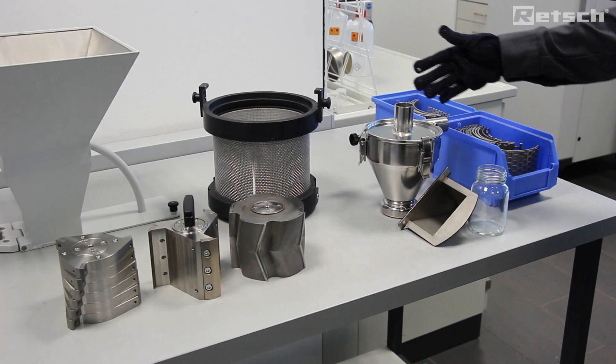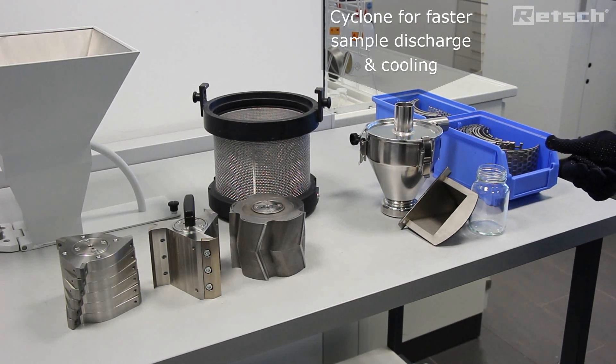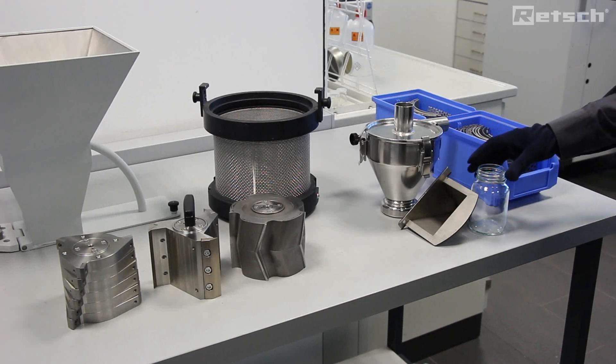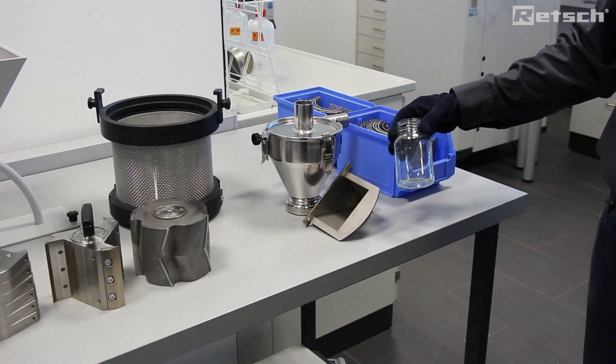Moving on, we can also see a range of cyclones whereby we can have suction provided by an industrial vacuum cleaner to pull through light and low density sample materials. And these can be collected in a variety of collection vessels including small removable glass bottles.